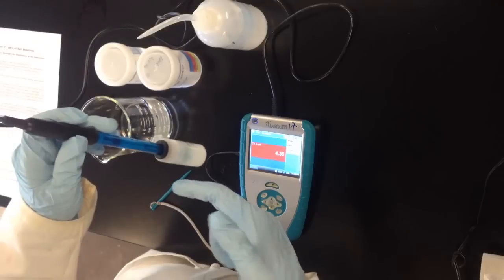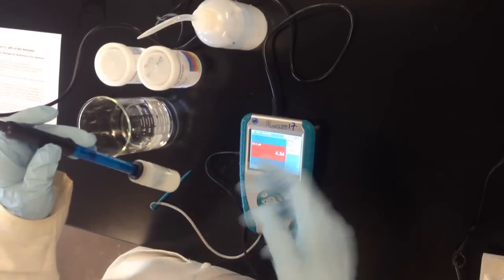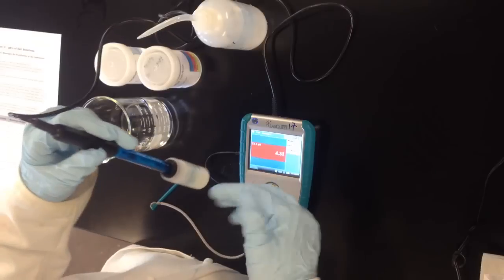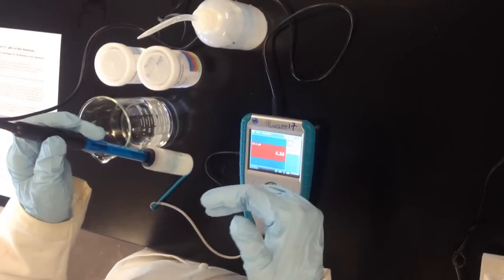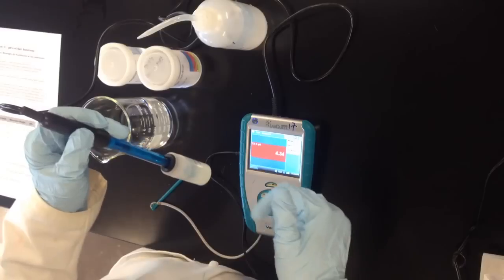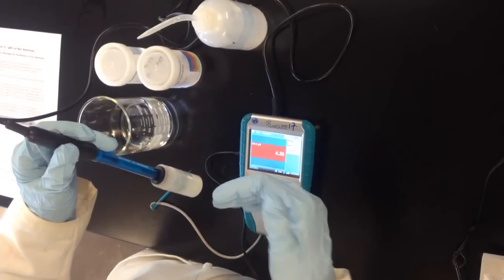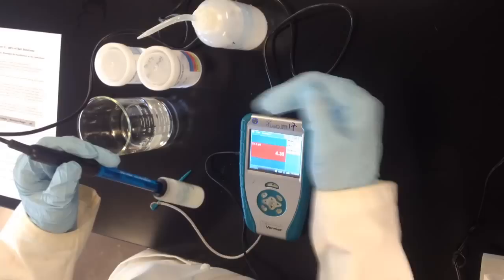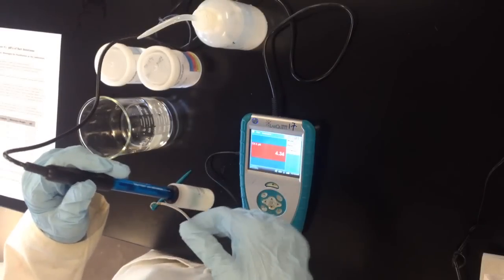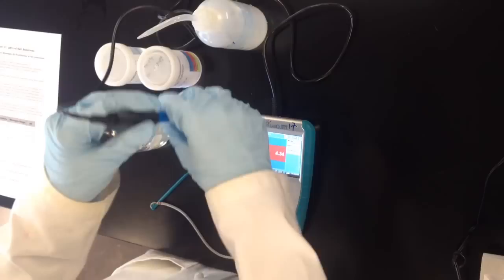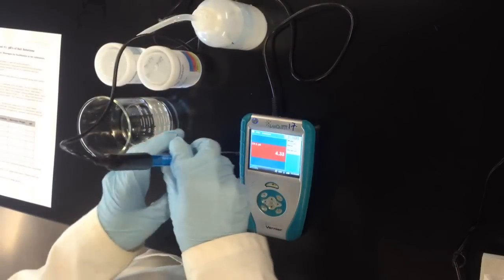The pH probe is basically just an electrode and the electrode degrades over time and gets bumped around, so its baseline voltage can shift over time. We need to calibrate the pH probe from time to time so that we get consistent pH readings over time. The probe has no knowledge of what its pH reading should be, so we need to tell it what its pH reading should be.